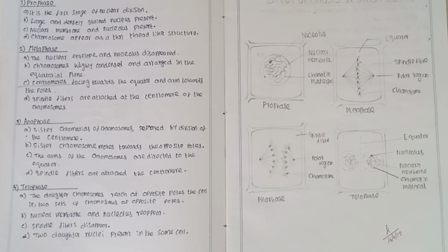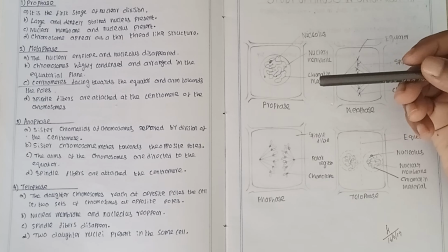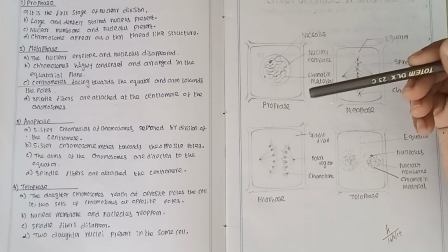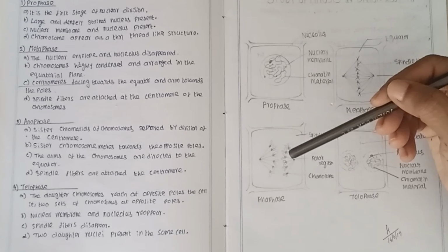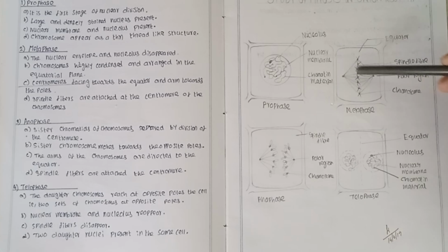Now the middle prophase is complete. Then late prophase: the centrioles reach the opposite poles of the dividing cell. Here we can see the spindle fibers.